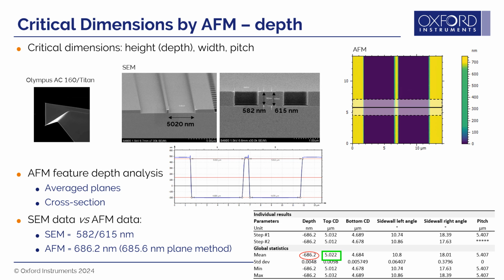This discrepancy could be attributed to the underestimation of results from SEM images. It is known that SEM images acquired with a tilt can affect distance measurements, so it depends on how the image was acquired. For example, what was the angle and position from where the user measured the area of interest? In other words, results are somewhat user-dependent. In contrast, during AFM measurements, it is the vertical position of the tip that comes into contact with the sample that is captured. The values depend mostly on the sensor noise, which is around 30 picometers for Jupiter XR AFM, and are not dependent on the user.